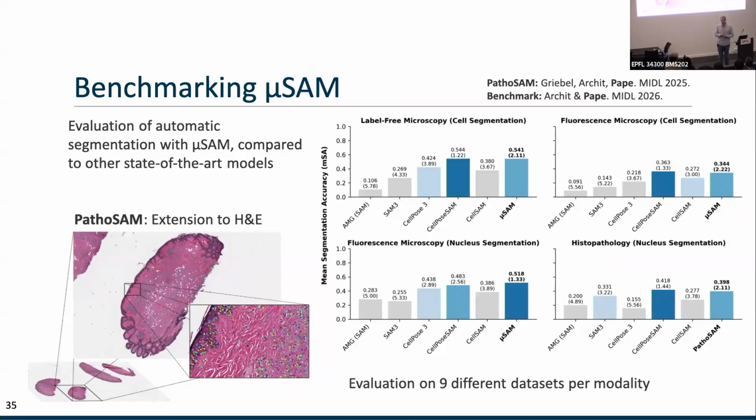It's still a pretty important question also because it really depends on the application, right? There might be cases where you just need to count or get relatively robust morphometrics, like the volume and so on, and these numbers are totally fine. But if there are cases where the exact shape matters, like for example there are filaments, there are protrusions from the cell, and you really want to quantify these, then this might not be good enough. So I think this is another part of these limitations, right? Saying when this is good enough is also not really a solved problem because it's very case specific.